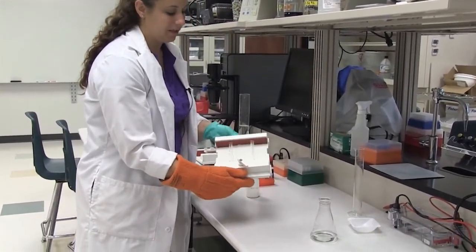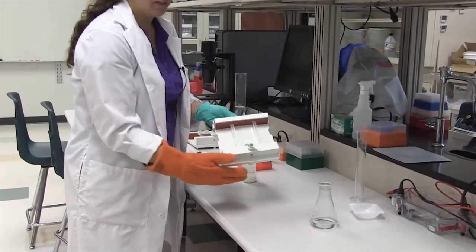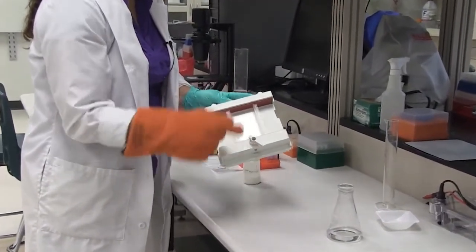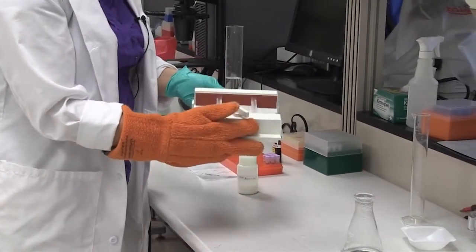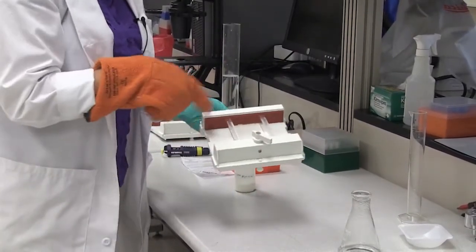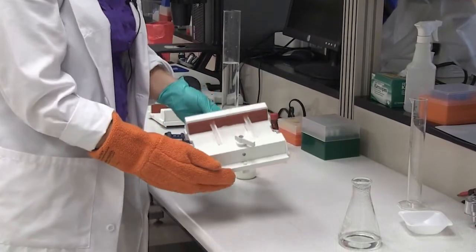The tray needs to be firmly secured between the two rubber dams so that it creates two barriers on the ends that you can pour your gel. If it is not secure in those rubber dams, the agarose will leak out and you will have to start this process all over again.